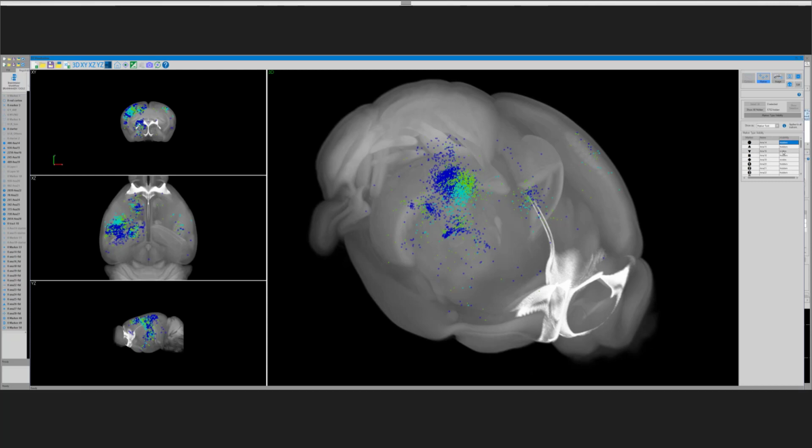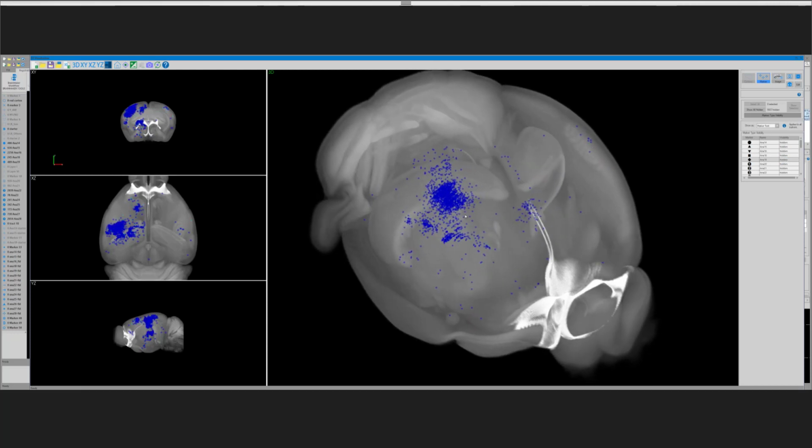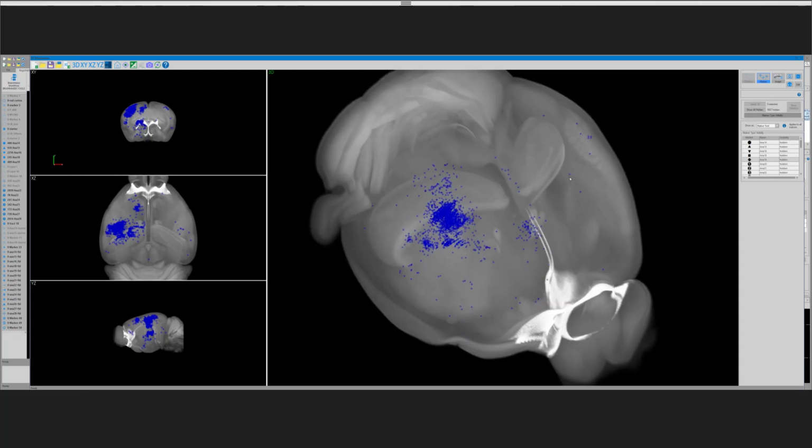With this program we can actually turn off different cases. So this is a single case, and this is the primary injection in the neurons. These are individual neurons that are projecting to an individual neuron in the somatosensory cortex. So all of these are transsynaptically labeled from this one injected neuron. Most of the neurons that project to it are local in the adjoining primary somatosensory cortex, but then there's a region in the secondary cortex and then the thalamus and prefrontal areas, contralateral areas.